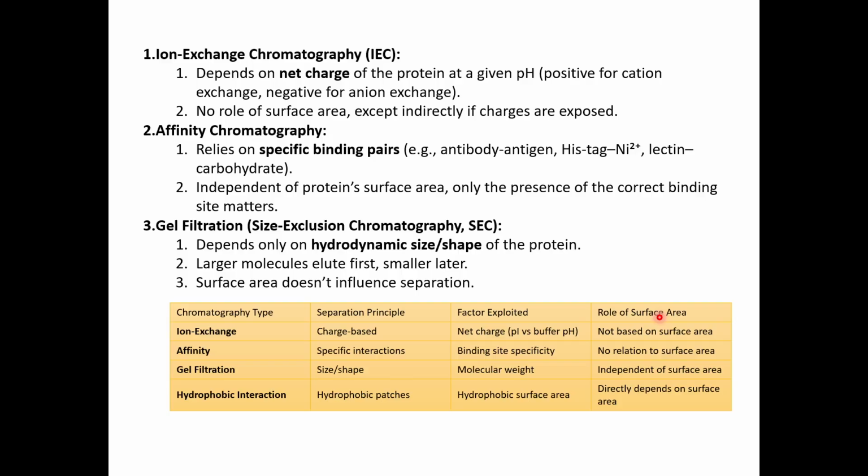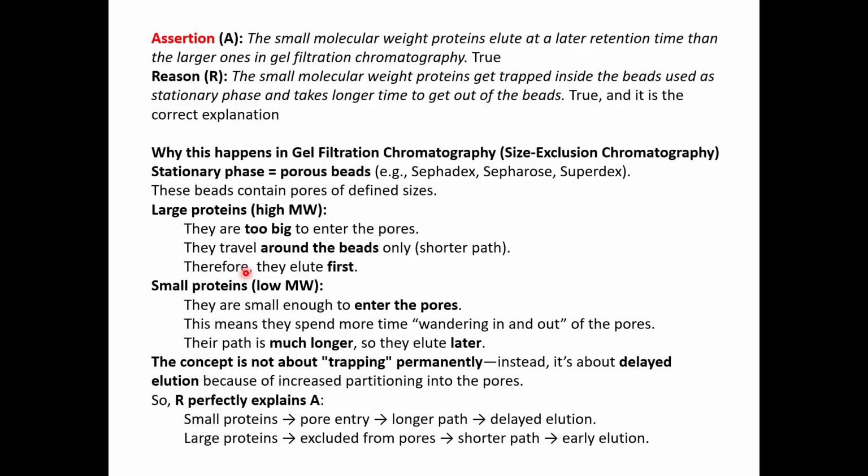Other than this, we had previously also discussed ion exchange, affinity, gel filtration, etc. Just a quick recap: ion exchange depends on the net charge of the protein and not surface area. Affinity is specific binding pairs like antibody-antigen, and it is independent of protein surface area. Then gel filtration is what we are discussing now.